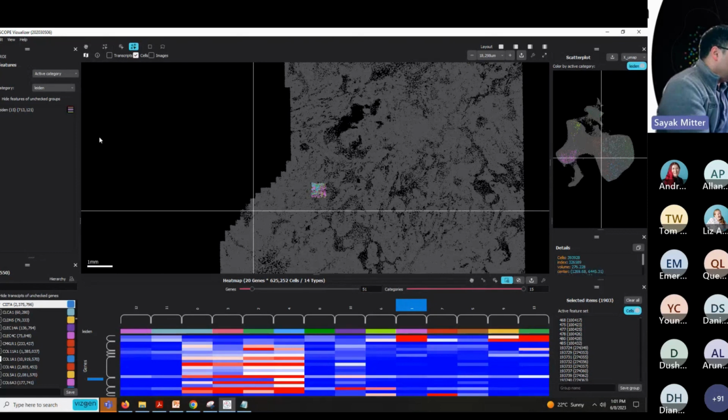If you want to use a primary GFP antibody that is compatible with RNA, which means that it's purified and BSA free, because BSA can bring in RNase contamination and damage RNA in the tissue, and such primary antibodies do exist, you can use that to stain your cells.